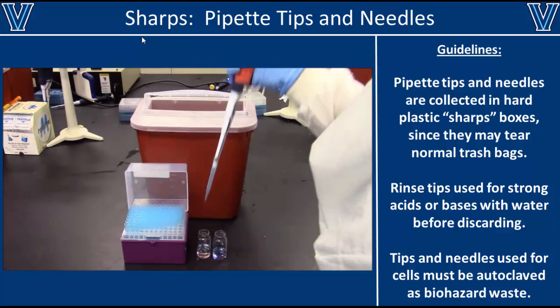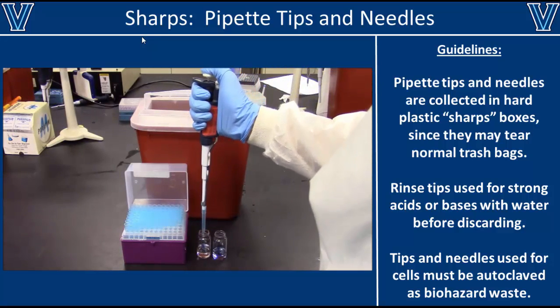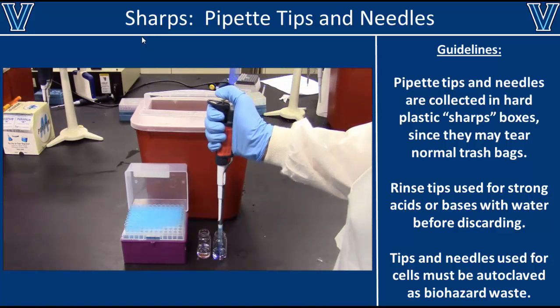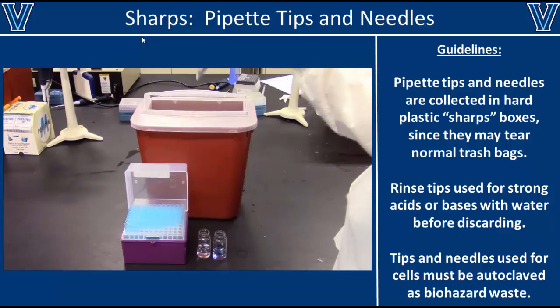If you ever use a pipette tip to transfer a hazardous chemical, for instance a strong acid, make sure you neutralize that acid with a base or dilute it with water before disposing of the tip in the sharps box.